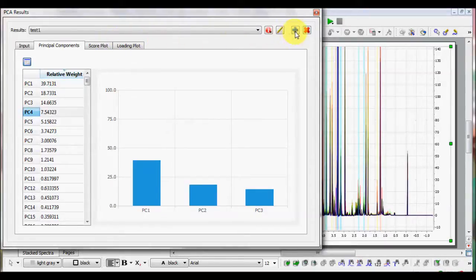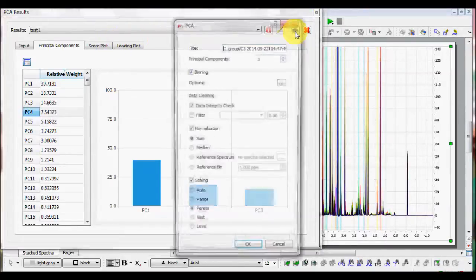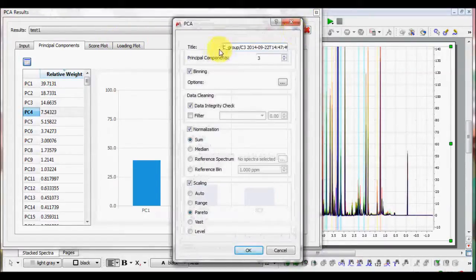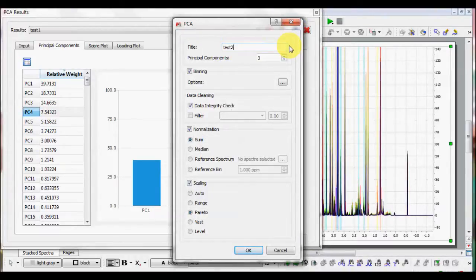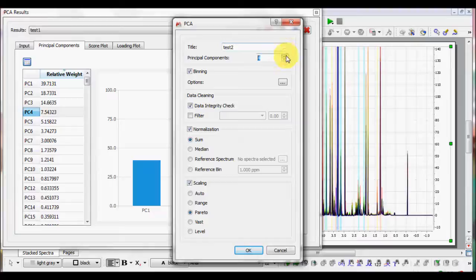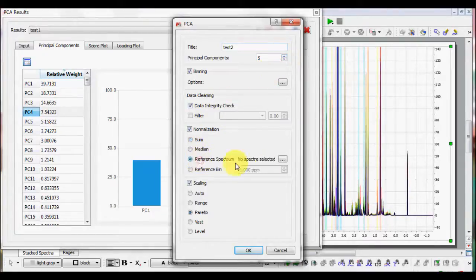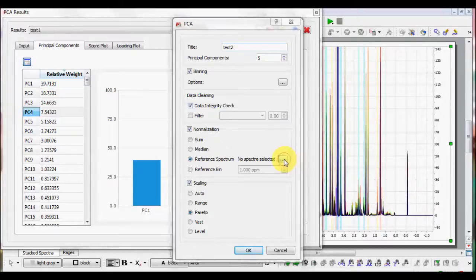You can run as much analysis as you wish by just clicking on the plus button. You can define the appropriate parameters. In this case, we just change the normalization mode by references to an entire class.